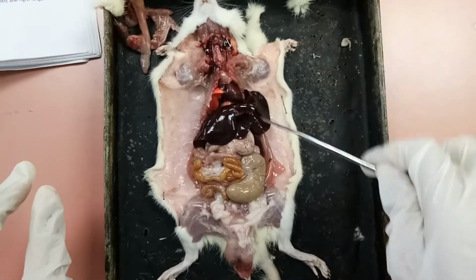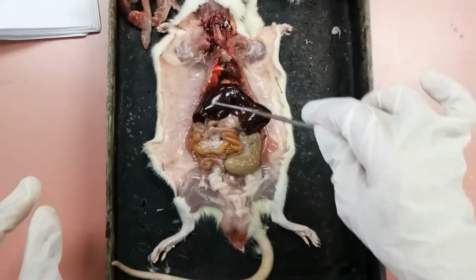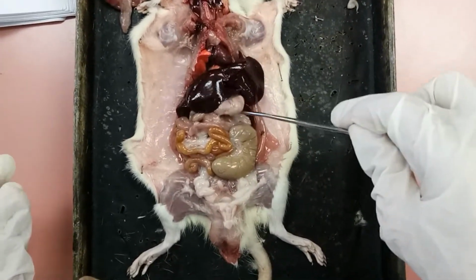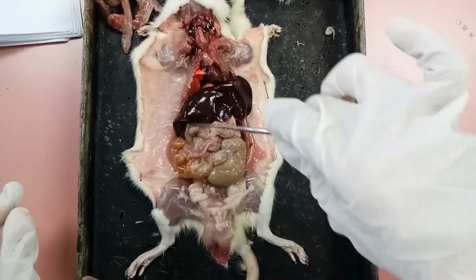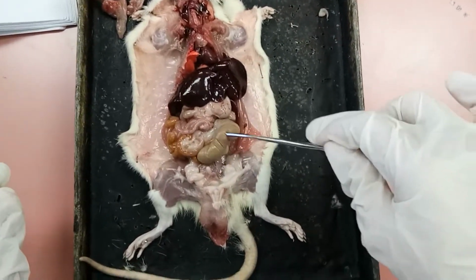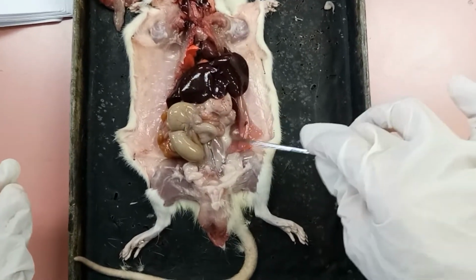Then these large lobes are the liver. Below the liver we have the stomach, and here is the spleen. Here is the intestine. This is the pancreas. This is the large intestine. Below it we have the kidney.